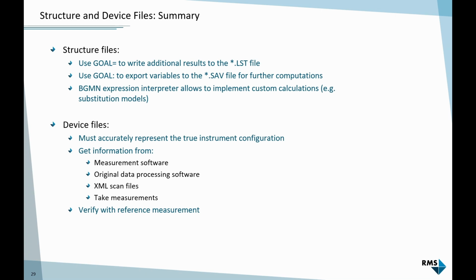After the lunch break, I have prepared 2 examples. Example number 1 will be continuing with the refinement of example 1, the calcite and apatite mixture. We want to implement these 2 substitutions, magnesium for calcium in calcite and sodium for calcium in apatite. You can try with the complex substitution model that compensates OH as well, or you can just try to ignore the charge imbalance and just replace calcium with sodium to see if it makes a difference.